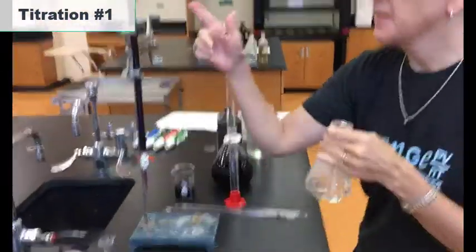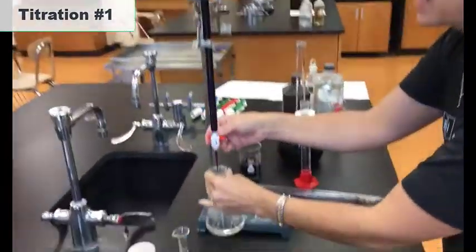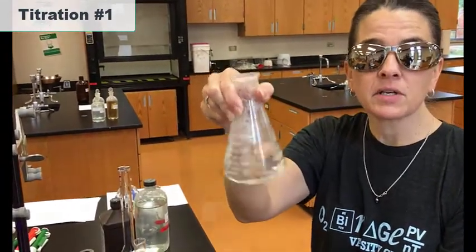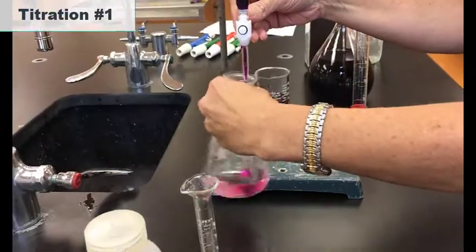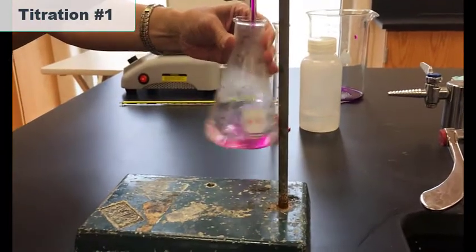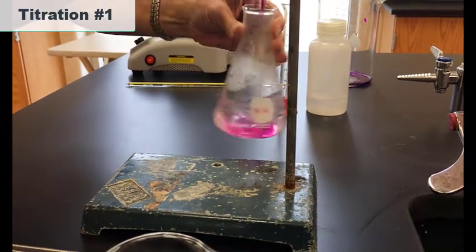And what you'll notice is potassium permanganate acts as its own indicator. So it's this purple color. And when I add it to my sodium oxalate solution and swirl, as the potassium permanganate reacts, that color disappears. So long as it is disappearing, I know that the oxalate ion is still present in solution, and I need to continue to add potassium permanganate. As soon as it stops disappearing, I know that there's no more sodium oxalate for it to react with, and that tells me I've completed my titration. So I'm looking for when I get just the faintest purple color remaining in solution.